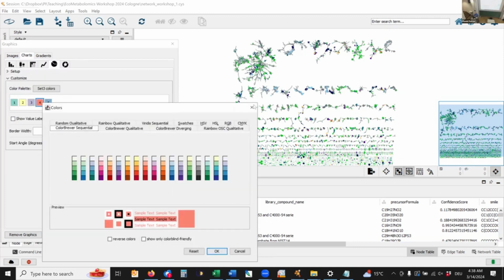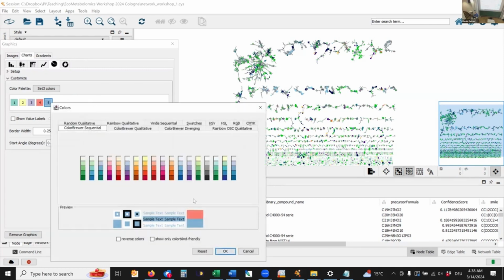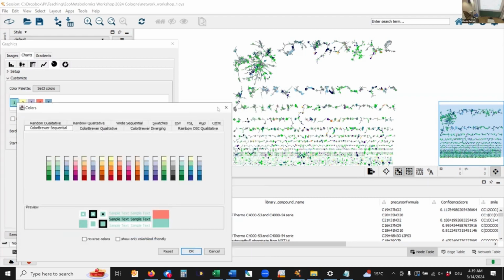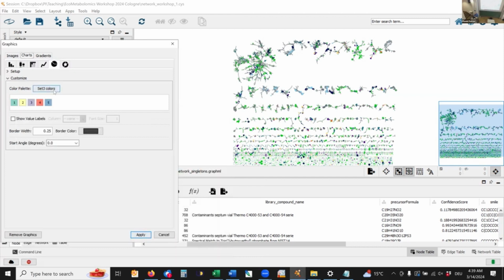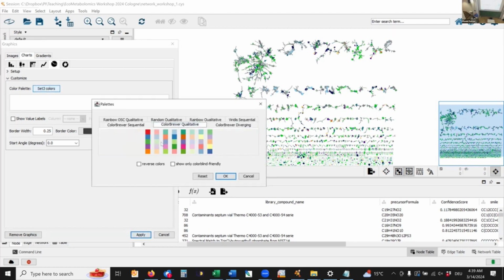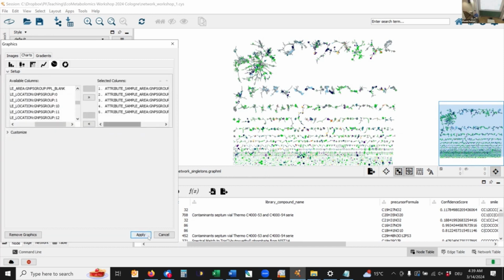Now I'm curious if Marco's trick also works here. Probably not. Too bad. That would have been amazing. But I can probably use the color panel here. Nice. Okay. And then assign these colors through those numbers to the different attributes. I select it, and then I hit apply.